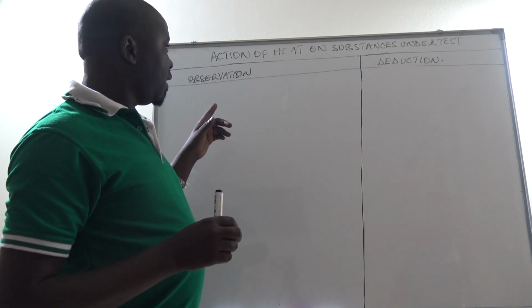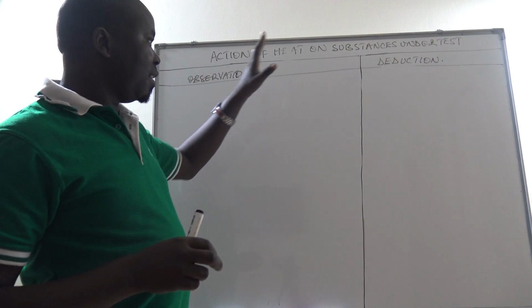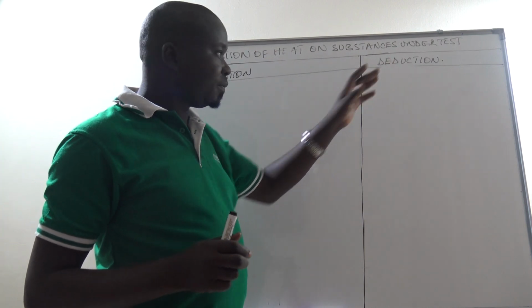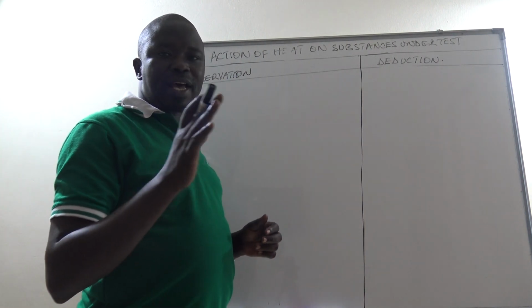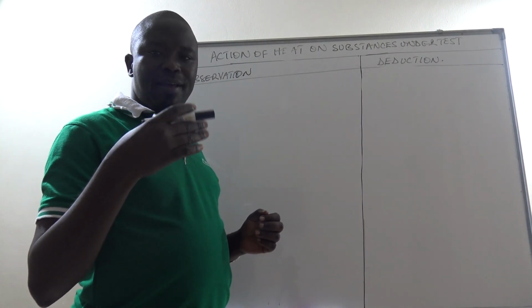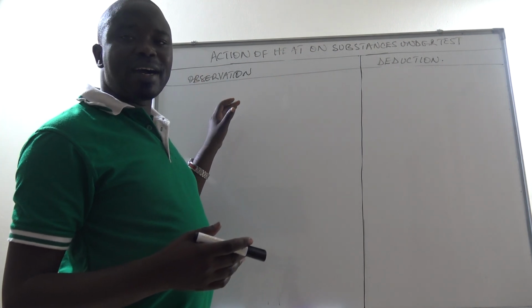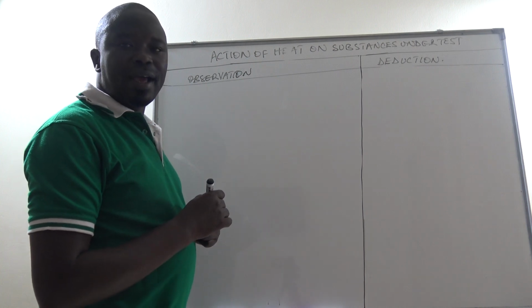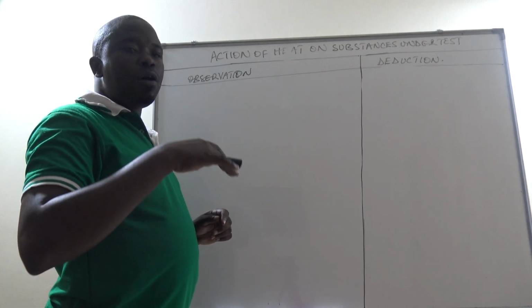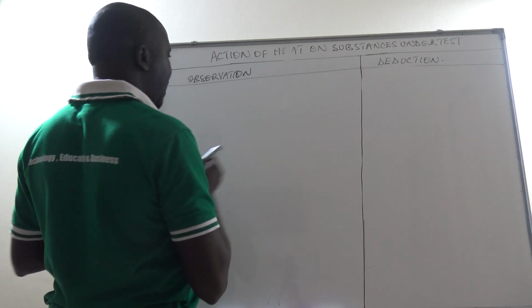That's the action of heat on substances. We are making our observations and deductions in this case. So, we had looked at crystallization got from gentle heating, how to record it. Then we looked at gases. So, in this case now, let us go to a sublimate before we can wind up with the residue got from the process of heating.